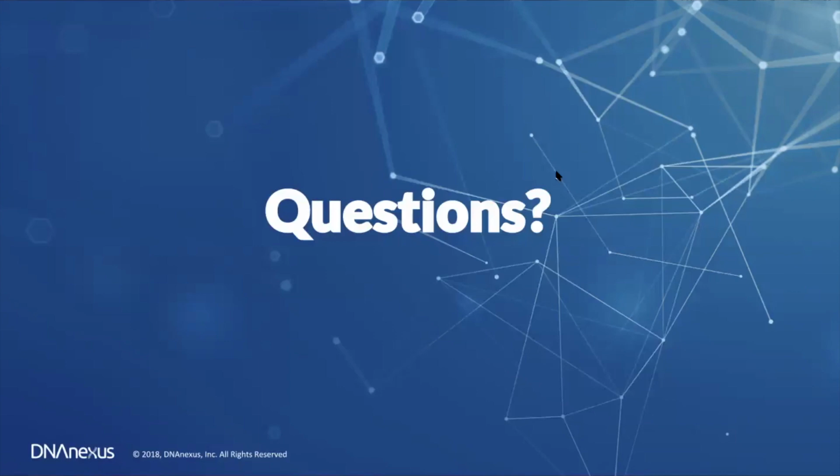Okay. Our next question is, can we use CNVkit to detect exon level copy gain loss? This isn't built into the app currently. There's a script in the upstream project for calling exons. It's called CNV test. And integration is an ongoing project. So I hope to see that in the DNAnexus app within another 1 or 2 releases, so a few months out.